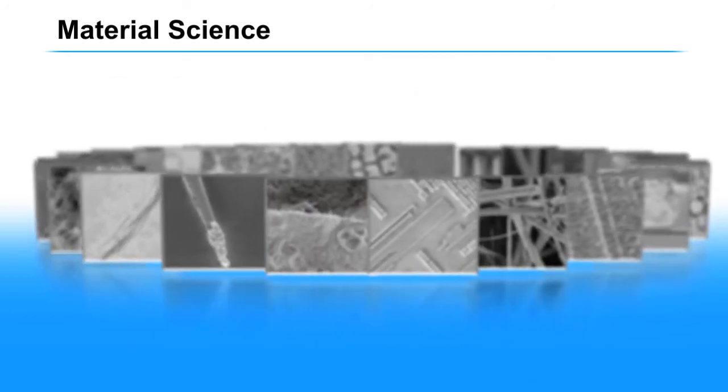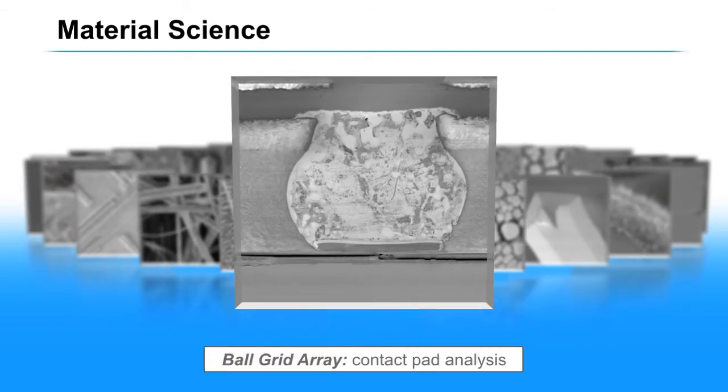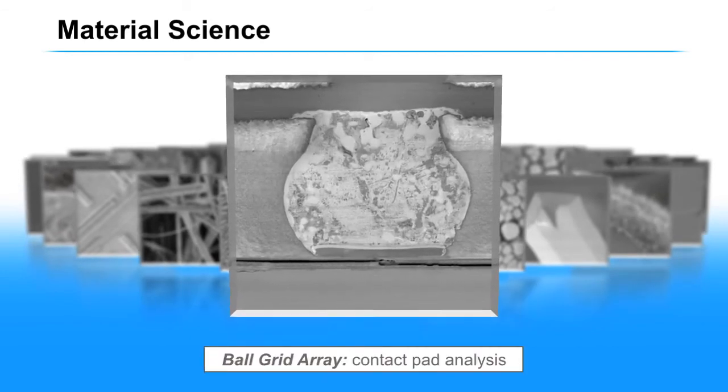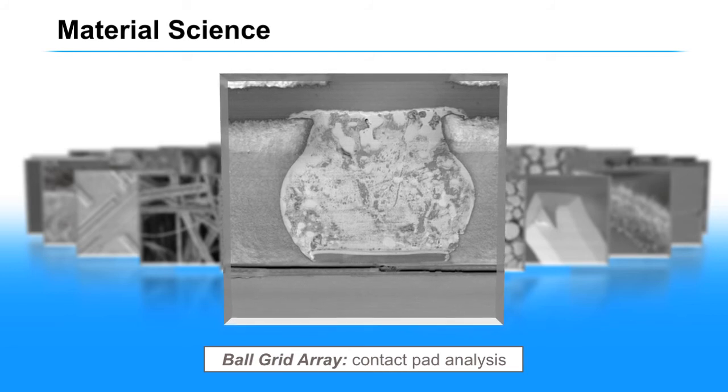We've also been able to use this kind of technique for failure analysis. Here, again, the advantage is because coating is not required. This is an analysis of a ball grid array. There was a failure and a void, and we were able to image it without coating, without additional work on the substrate.